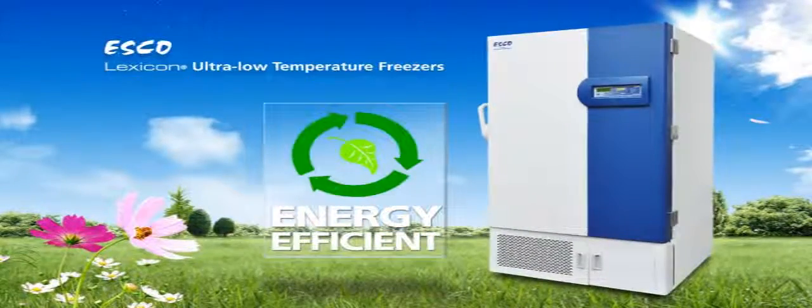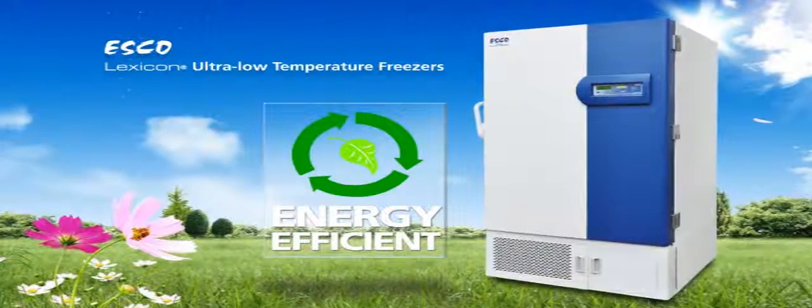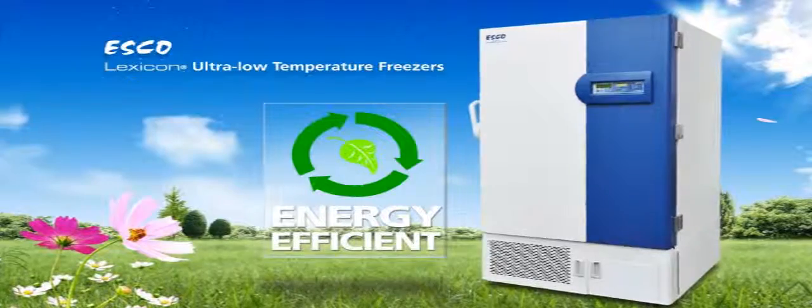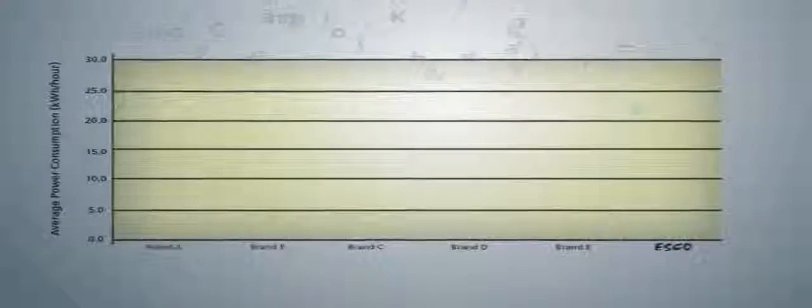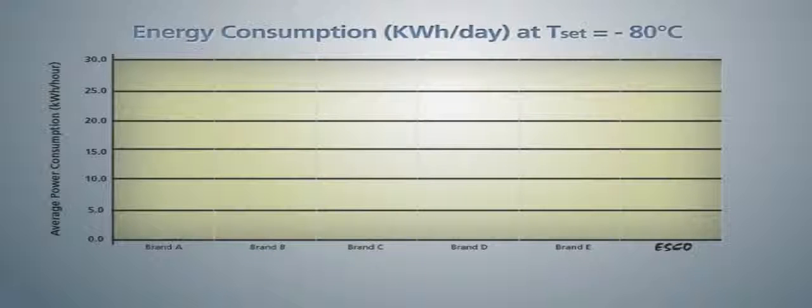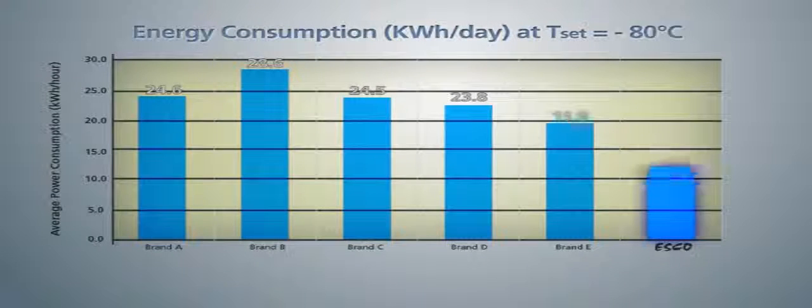Running a ULT freezer can be very costly. In the long run, an energy efficient freezer results in a lower total cost of ownership compared to a poorly designed freezer. Esco ULT freezer has the lowest energy consumption among conventional ULT freezers of similar size.